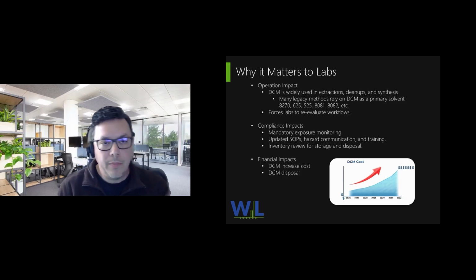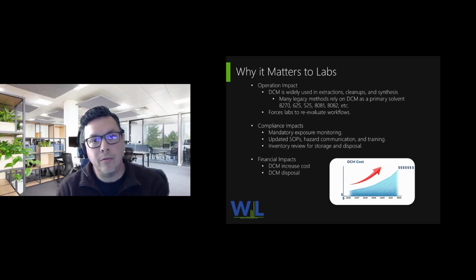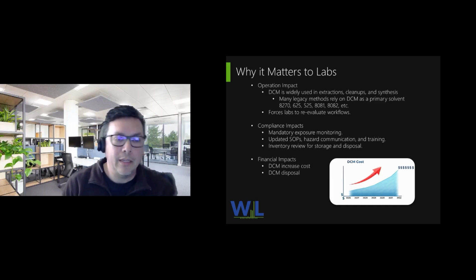So it's also going to assure that our hazardous communication plans, training, and SOPs are updated, and the inventory of what's stored in the lab is also going to be well documented. And the bottom line is going to affect the financial impact.